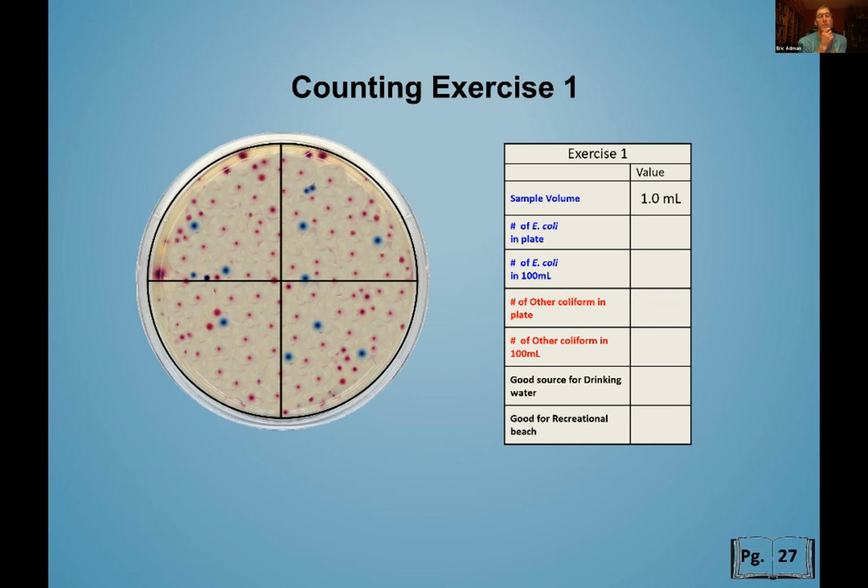All right, so let's do an exercise. Let's have you guys go ahead and maybe unmute and go ahead and count and call out how many colonies you see in this sample.